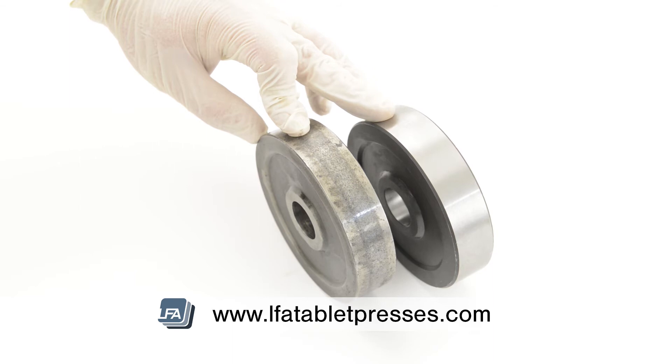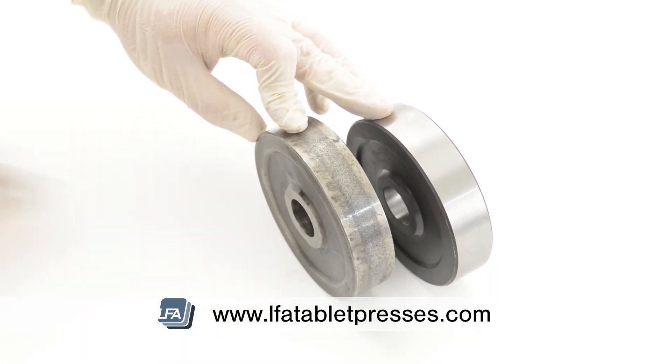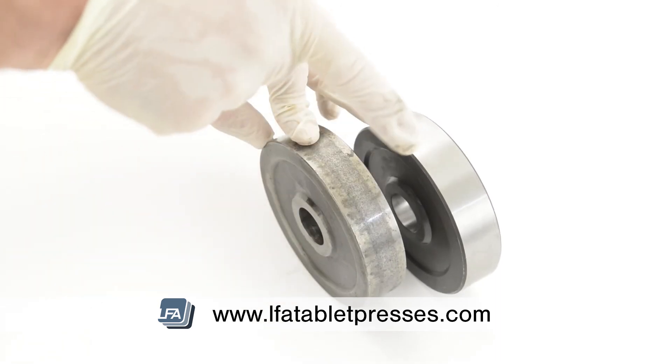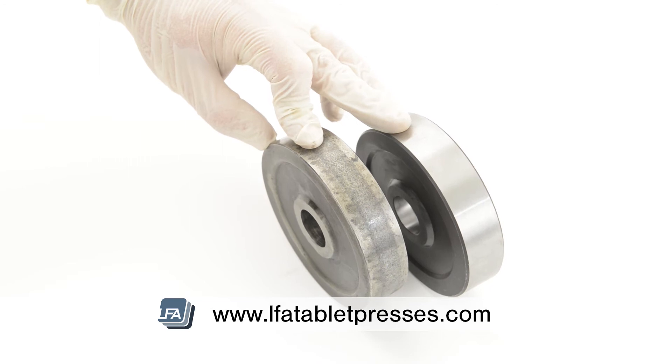As you can see from our worn roller cam, there's a line beginning to form. Eventually this will begin to form a groove with high points at either side. As soon as you can feel this is when you would be changing your cam, as not doing so will damage your tooling, make your tablets soft and put them out of tolerance.